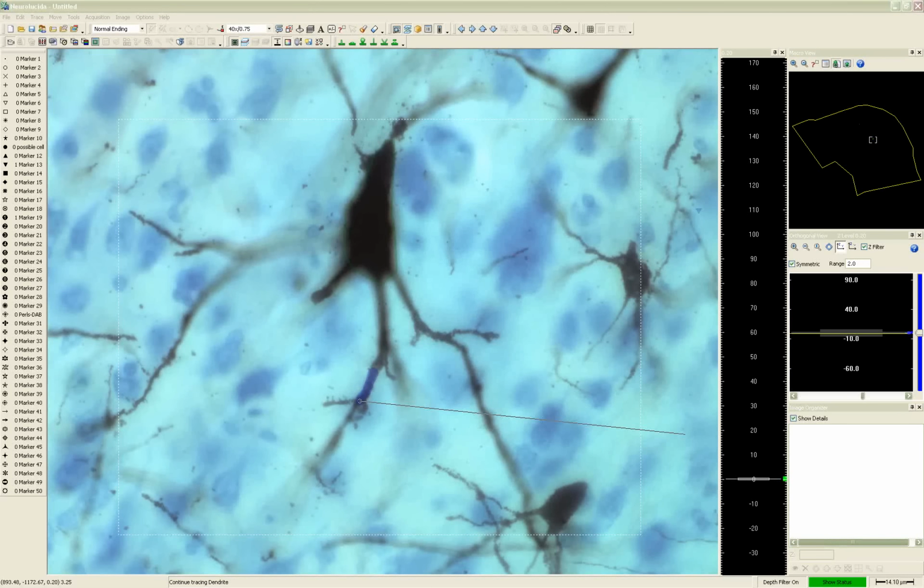Catherine has a question. She's interested in tracing spines, which based on the registration questions that I asked before the webinar, it sounds like a lot of people are. And her question is, can I trace the dendrites first and then mark the spines after? The answer to that is yes. Neurolucida allows multiscalar reconstructions, and we try to make it as easy as possible.